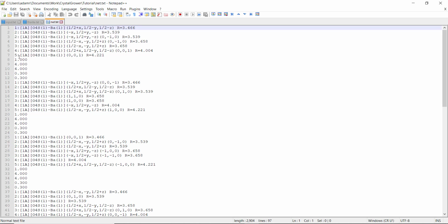These numbers before the colon here are the interaction types. You can see we've got 7 interactions, 7 lines, and there are 5 interaction types because 2 and 3 are doubled. These are the interaction types based off of the molecule or ion's point group. Provided the ions are related by symmetry, these interaction types should be the same for each of the same ions. If their coordinations are slightly different, then these will not be the same. They'll be different because their point groups will be different.